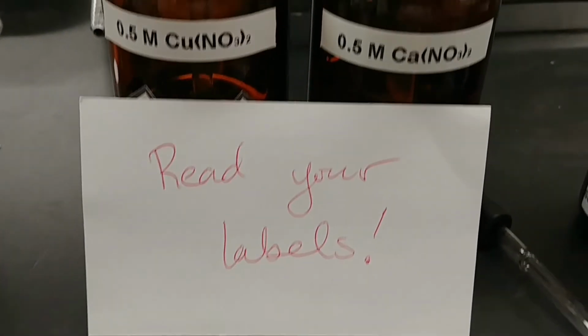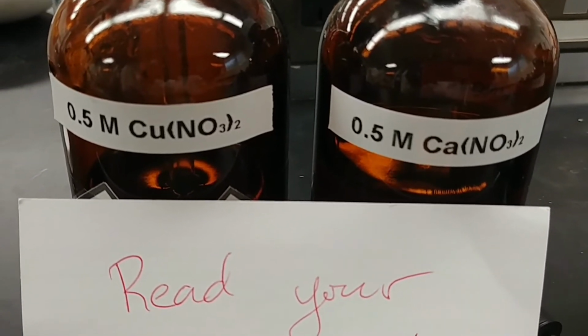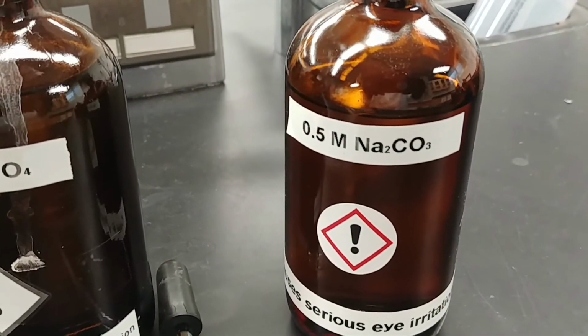Please make sure you read your label because look at how similar those are. It's very easy to get your reagents confused when they have very similar letters. Next up we have sodium phosphate and sodium carbonate.